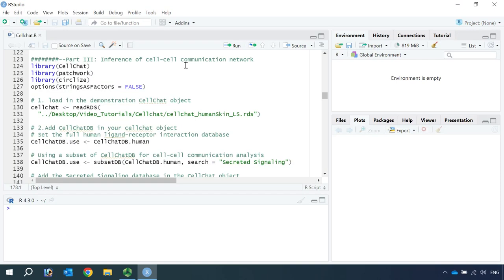Hello everyone, welcome back to my third CellChat video tutorial. Today we are going to actually do the cell-cell communication network analysis.